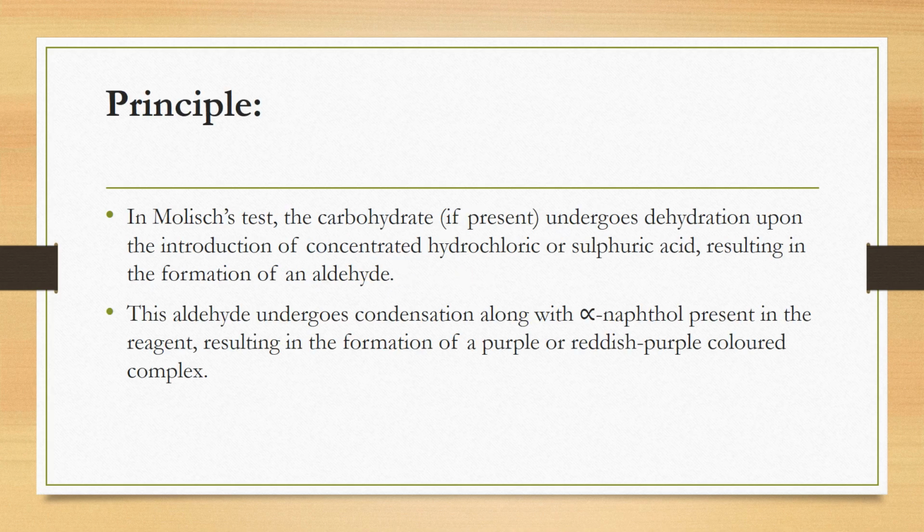The principle of the Molisch test. In the Molisch test, the carbohydrate, if present, undergoes dehydration upon the introduction of concentrated hydrochloric or sulfuric acid.